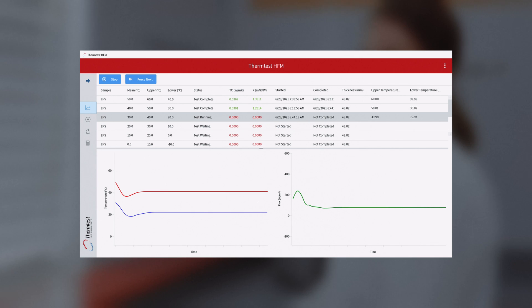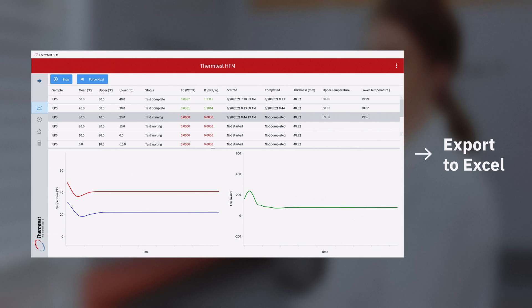Results are displayed in both tentative and final stages, then saved for report printing or export to Excel.